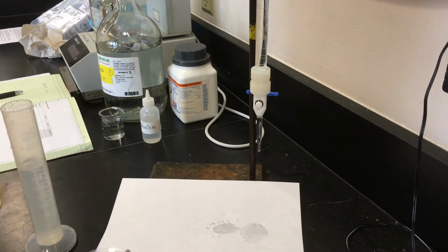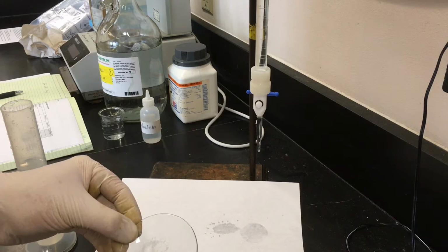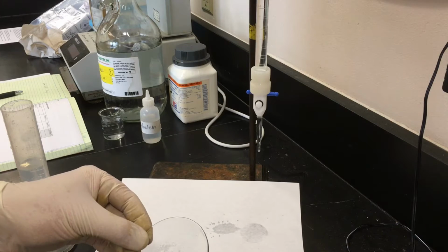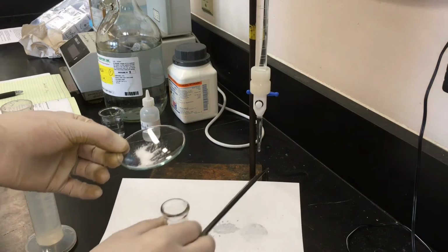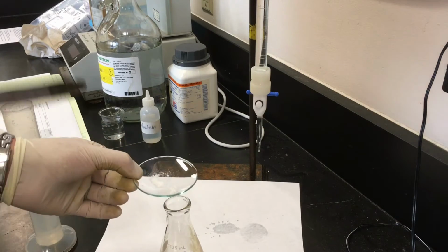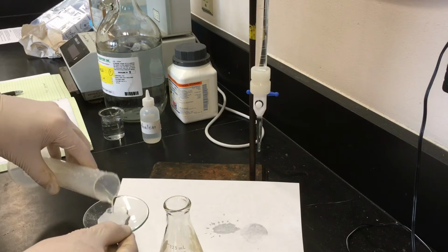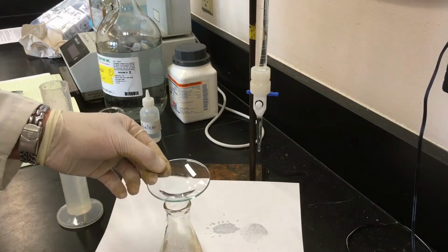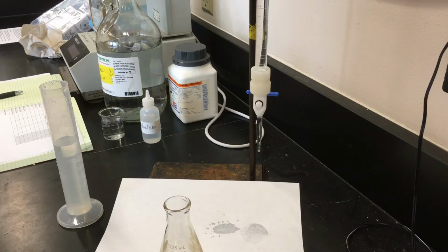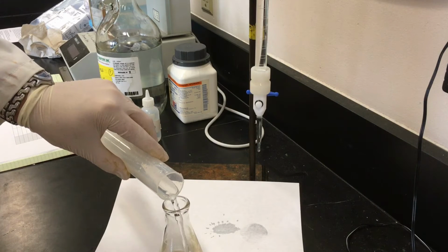So we've carefully measured the KHP, and what we're going to do is add the KHP to some water and make a solution. And we're going to carefully add all of the KHP to the Erlenmeyer flask. And we're going to rinse the watch glass with a little bit of water and pour that into the flask, just to make sure that we get all of the KHP. Add some water.